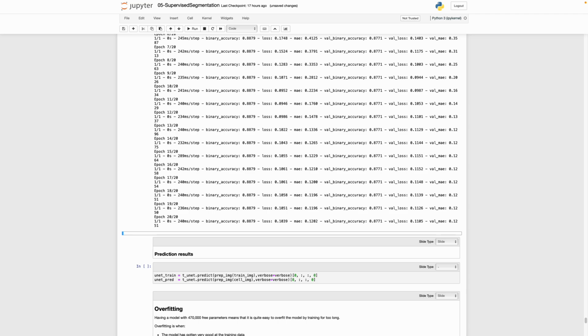Isn't epoch like different parameter tunings? Like each epoch is like... It is in principle an iteration of the training. Okay. So it does the parameter tuning and sees, okay, I get this output. So it's an optimization part of the iteration.